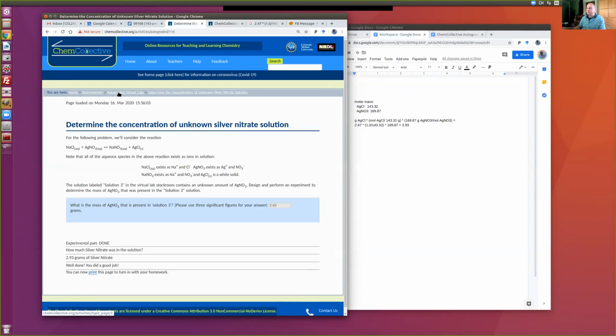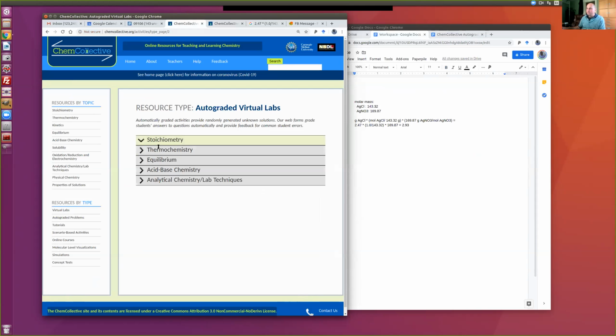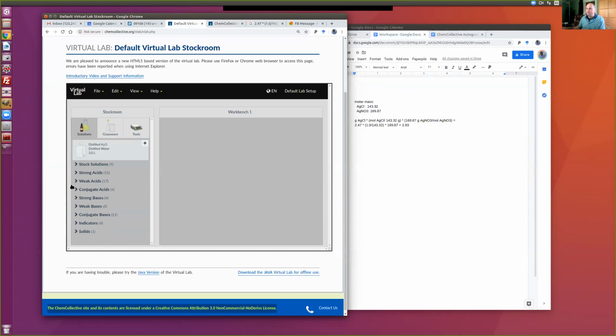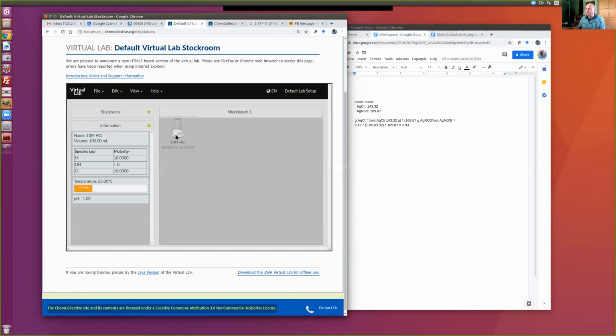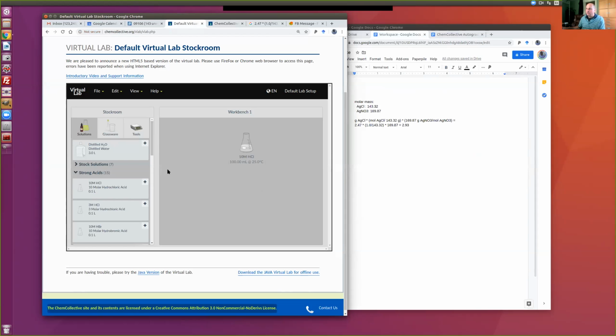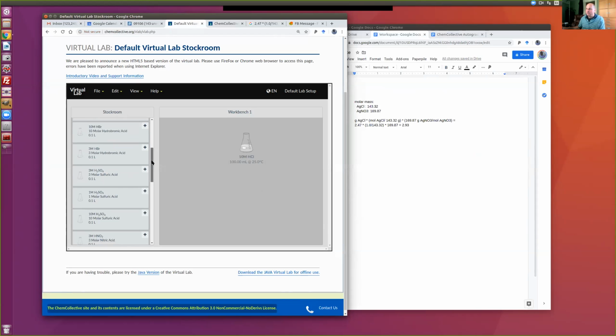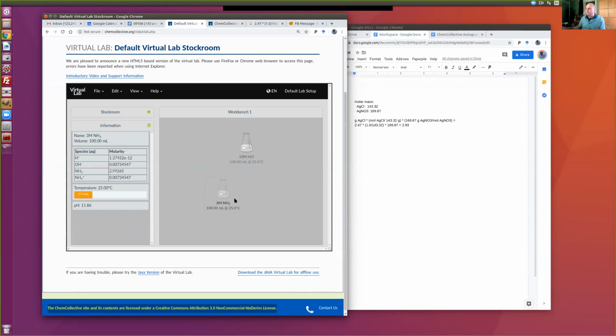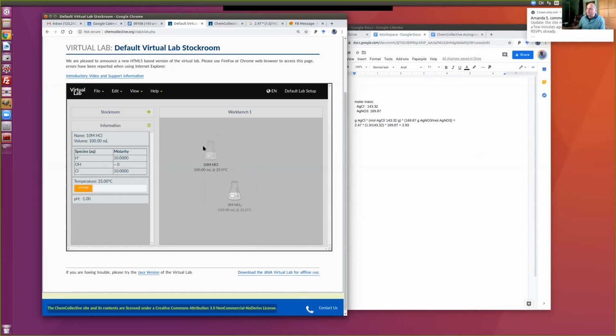Let me show you a couple user interface things. I'll just go to the default lab for this. I mostly want to show you the main problem students have, or users have, I mean. You would think that that would start pouring. So to pour this into that, you have to drag it, but you have to drag it until the thing you're dragging onto lights up. Once students know that, everything else is fairly intuitive.